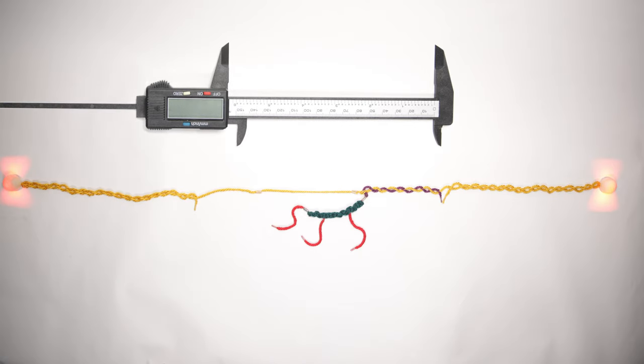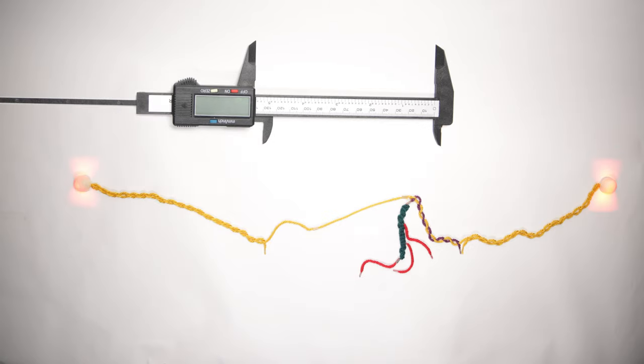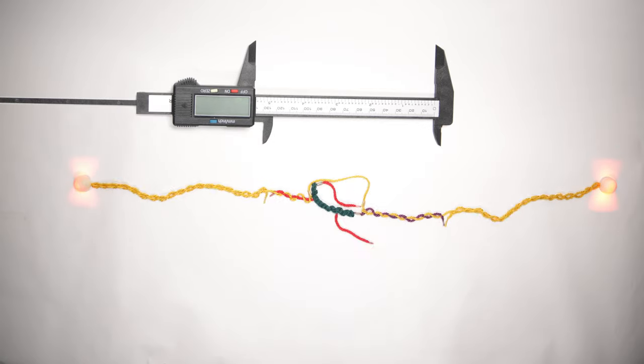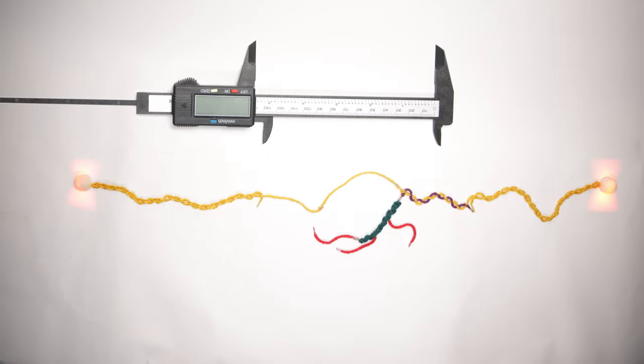But when we apply force to the structure by pulling the microbeads apart, the weak handle bond is released and the looped DNA stretches back out into a linear state. This process is repeated with the other weak handles, allowing us to map out the distance from those handles to the strong handle based on the change in length between the looped and linear states of the structure.